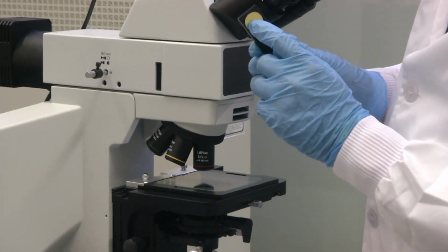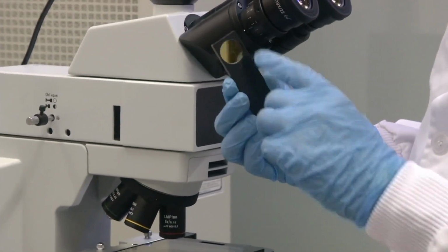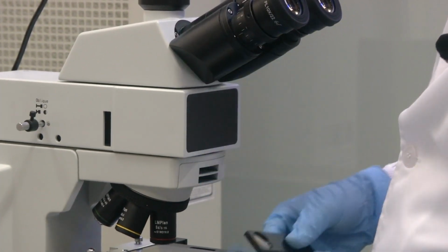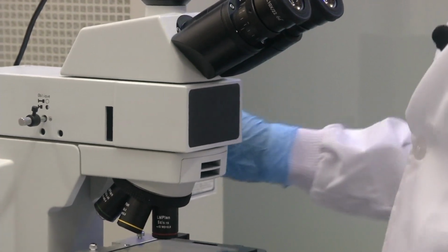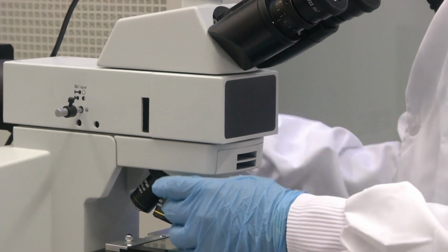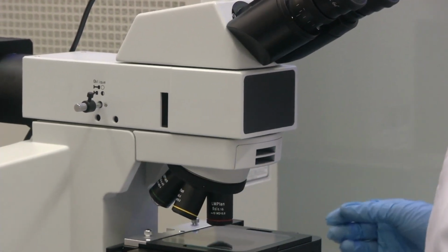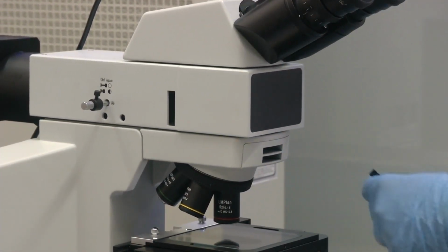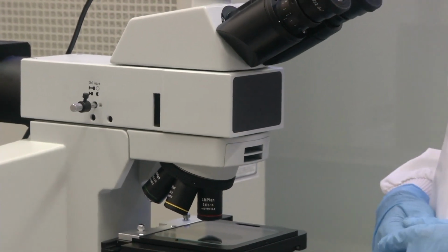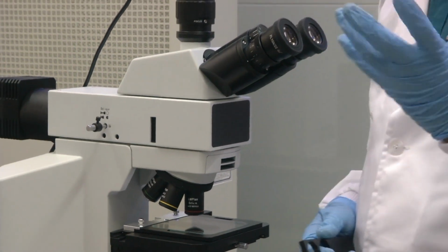Here if you can see, we have put a filter here. I think you can see a small color difference. So that is one filter that is put. So these filters you have to insert. There are places where you can insert these filters into the microscope and they will come into the picture. So suppose you want to do fluorescence imaging. So what is fluorescence? Let us say you are studying some sample.